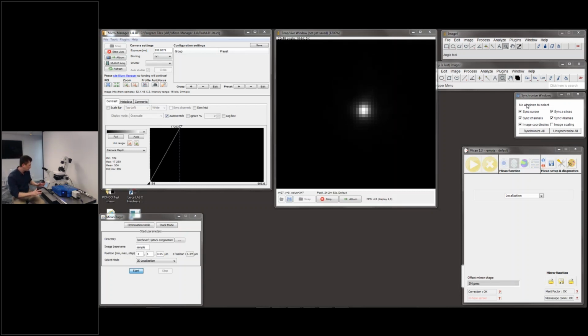So still a couple of words about MicAO. As you can see, it can be easily attached to the emission port of the microscope, and inside it contains a deformable mirror which has 52 actuators, and this is sort of an optimum number of actuators for correcting aberrations which can be found in the microscope. The device is functioning as an image relay, so we have an image plane at the exit of MicAO, and inside there is a back focal plane where the deformable mirror is installed.